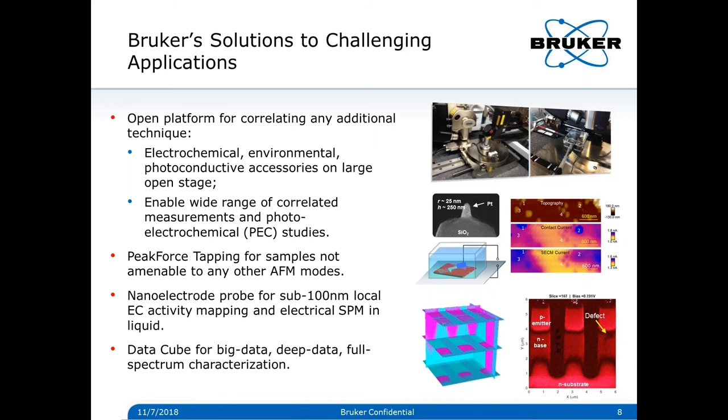And of course, Bruker has its unique PeakForce tapping mode. This mode is very good for samples that are not amenable to any other AFM modes, because it's an off-resonance tapping mode, so you don't need to worry about high imaging force, and you can also get a lot of other properties at the same time.